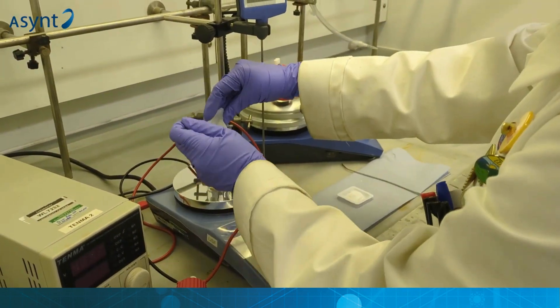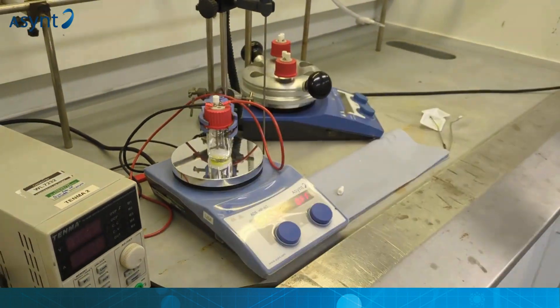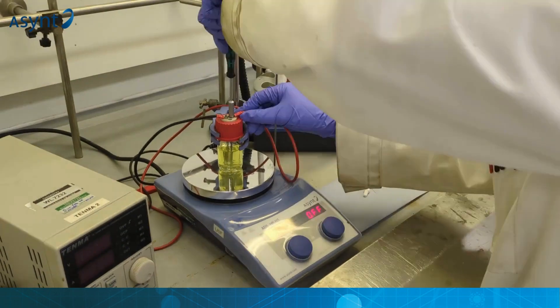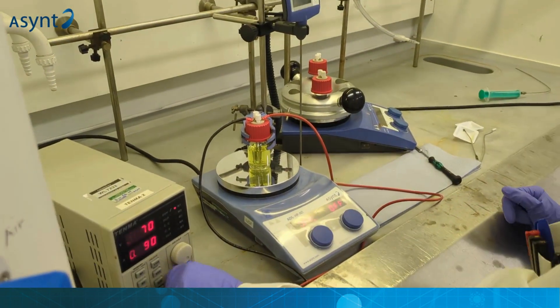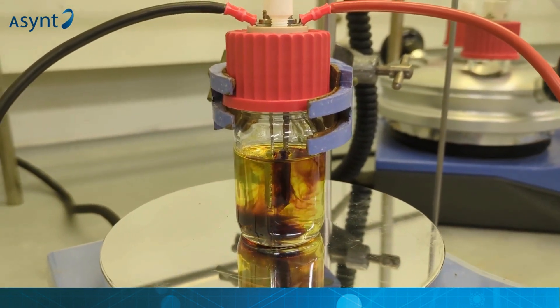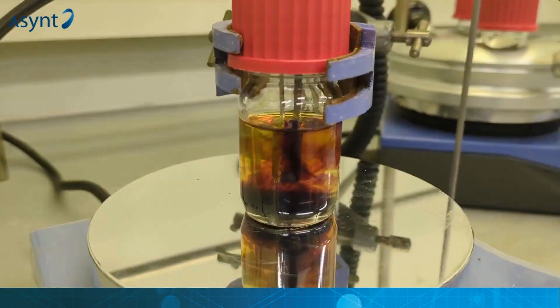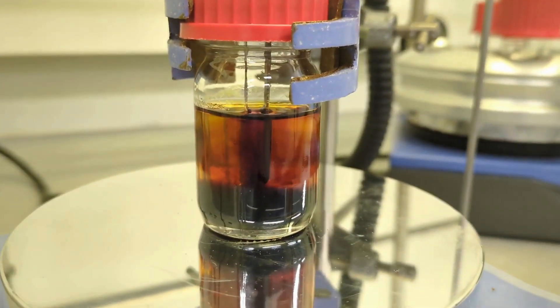You can now see here one of these individual cells running a basic reaction that is apparent by the colour change in the solution within the cell. Obviously this would be carried out within the base ordinarily, but we wanted to show you the effectiveness of the reaction.